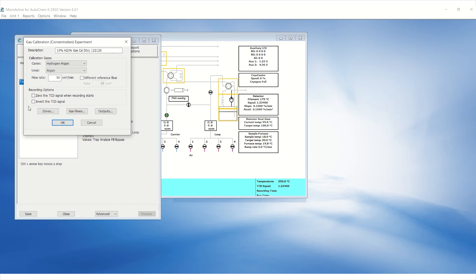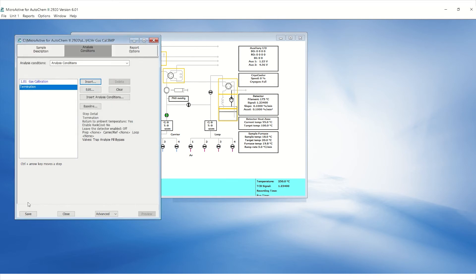Also, check the recording options. Zero and invert TCD signals should match the experiment. Click OK and save the file.